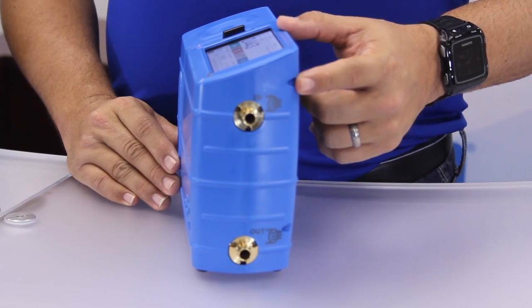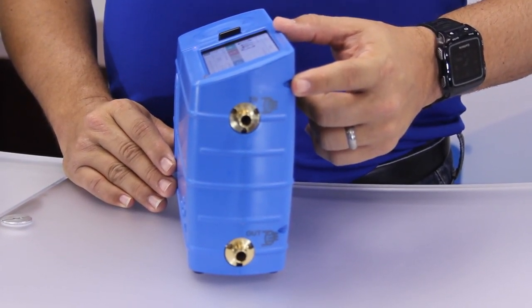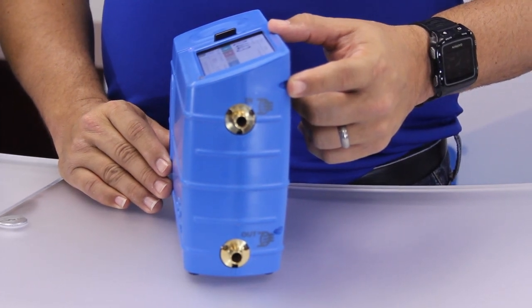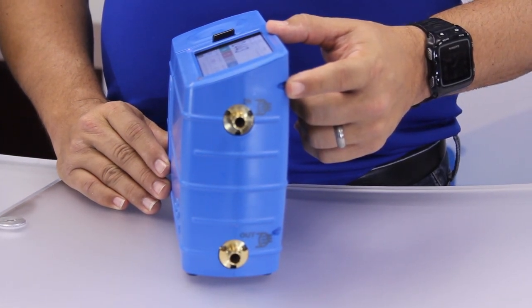K is the inlet barb, located on the top side of the base. This is where makeup air is drawn into the calibrator when using a vacuum source like an air pump. It may also be connected to a positive air flow source like one used in a bag fill operation.